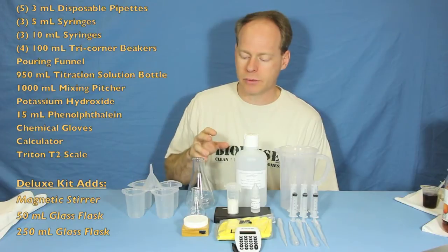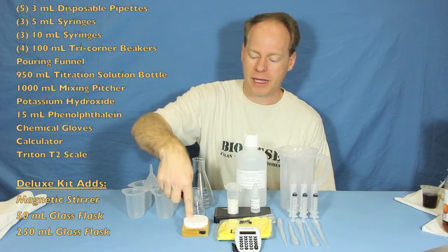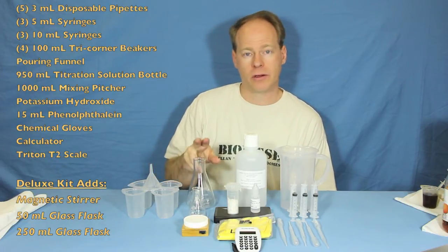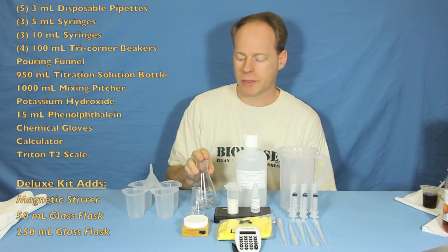This kit also comes with a magnetic stirrer — this is a really nice portable magnetic stirrer. Also included are a little 50 milliliter Erlenmeyer flask and a 250 milliliter Erlenmeyer flask, so that you can do larger things such as soap testing with this.